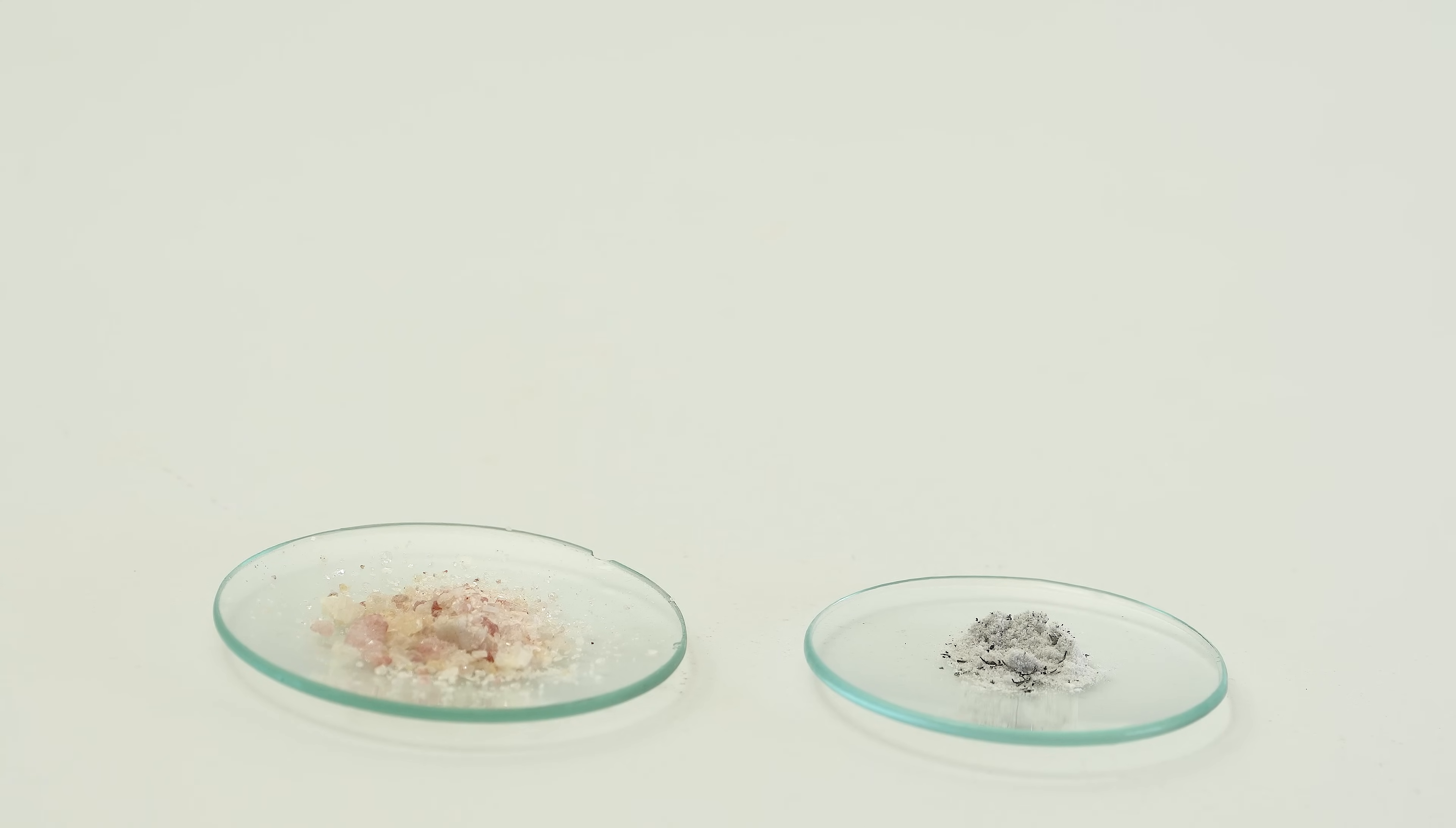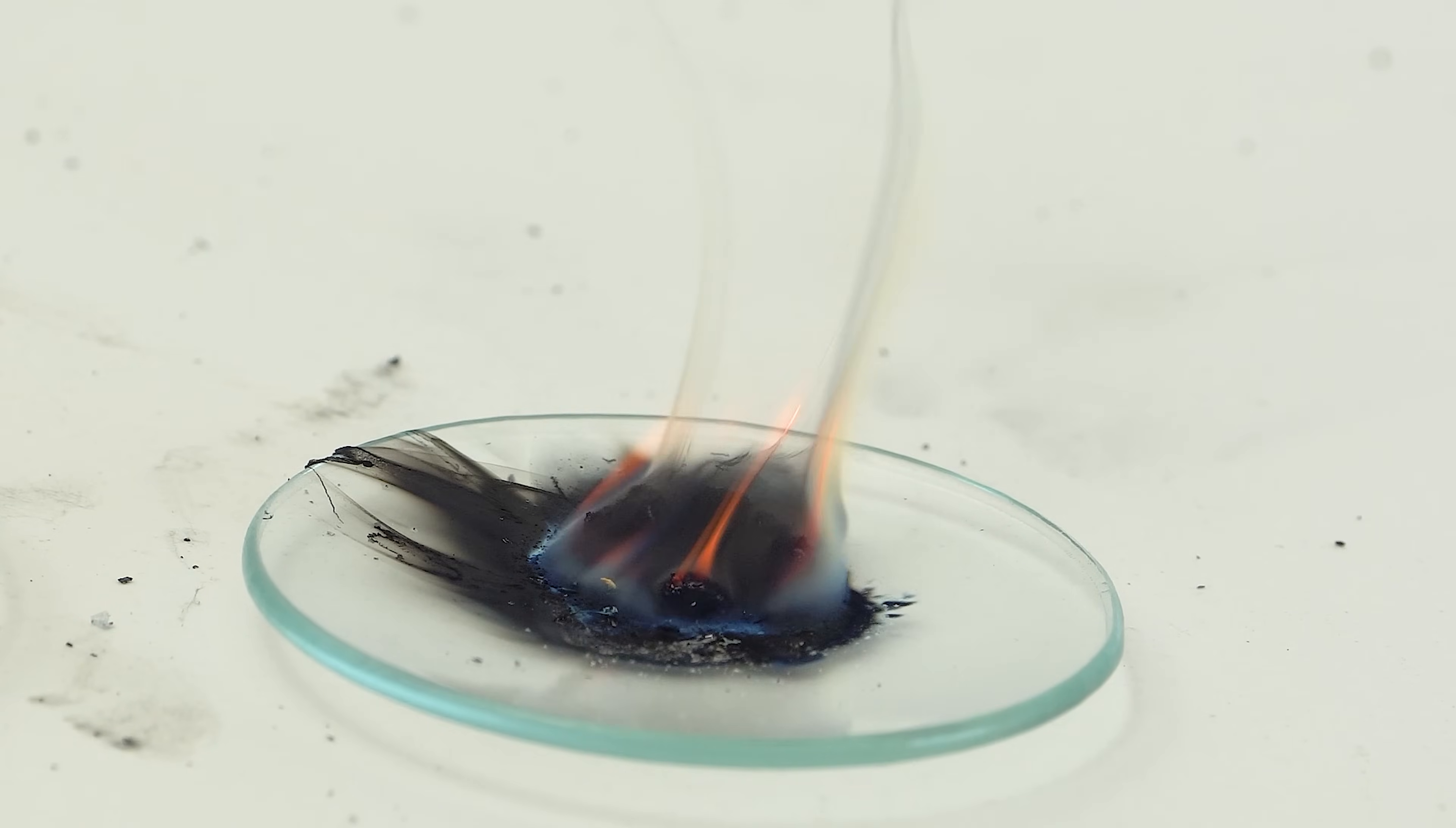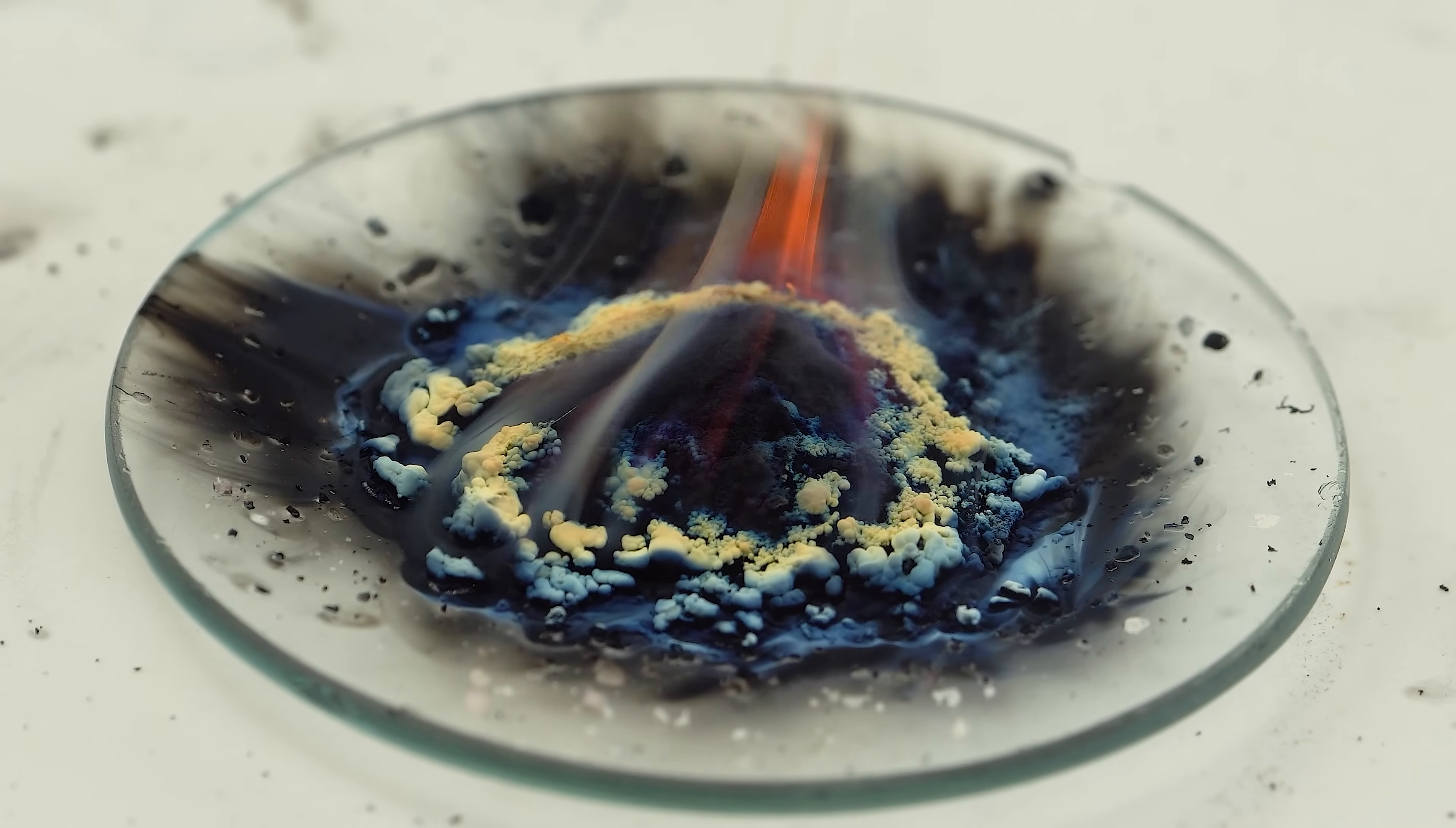Tungsten hexacarbonyl is a flammable substance. It ignites easily. Among other combustion products, we can clearly see yellow tungsten trioxide formed.